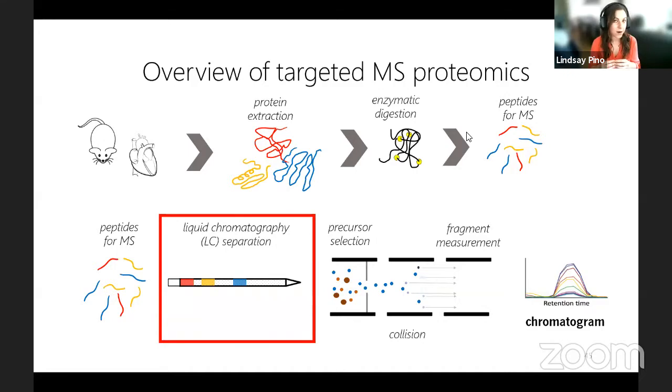There are arguments for both camps. Some researchers argue, since we're measuring peptides by mass spectrometry, we're not measuring proteins, all of our differential statistics should be done at the peptide level. There's other camps that argue, but that's not interesting. We want to know the protein level information. So peptide abundances are rolled up to protein level. You'll find arguments for both. It's a hard question, and we don't have a good method right now to say exactly, if some peptides increase abundance and some peptides decrease abundance, what happened to the protein, but that's an active area of research, I know.